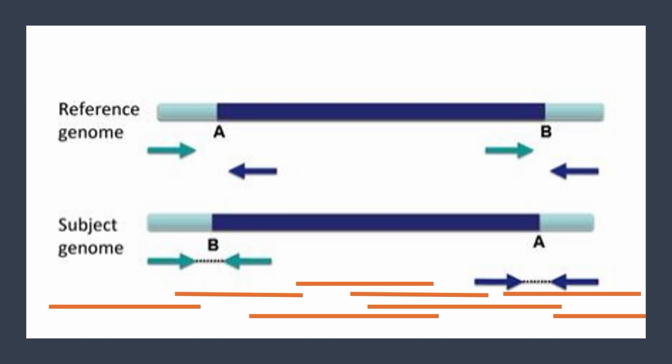But in the case of reads that span the inversion breakpoint, part of the read will align well to the reference genome and the other part of the read will not. These reads are now indicated in red. IGV will align these in the orientation that maps best to the reference genome, but the portion that does not map to the reference genome will be very colorful because none of the nucleotides will match with the reference genome in that segment of the read. The black lines here indicate the division point between full alignment to the reference and complete non-alignment to the reference.